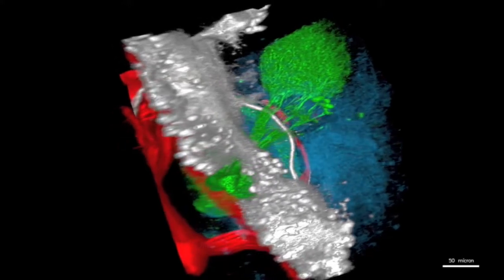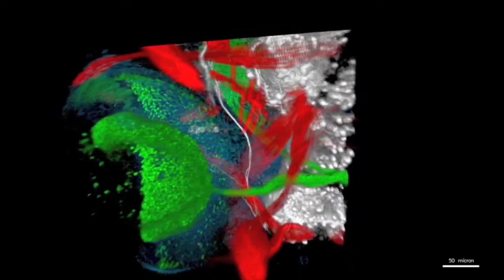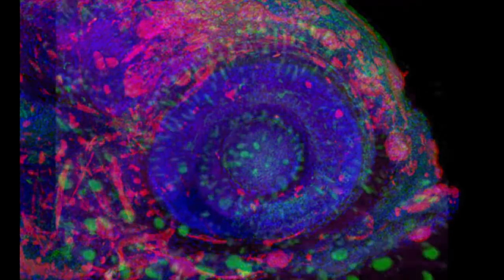So he came to talk to us about could we help him, and at the same time we had a lot of work on volume rendering and multidimensional transfer functions, and said, you know, this could apply to the confocal data, though we'd never done it. And through that collaboration, we built the prototype tool that turned into FluoRender.